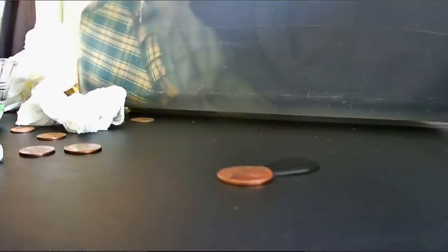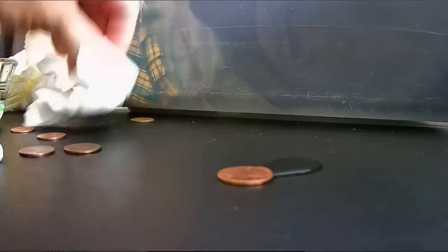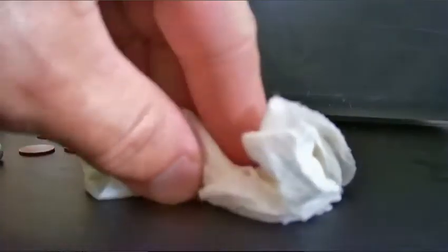Alright, so it spilled at 36, so we're going to record that as 35.